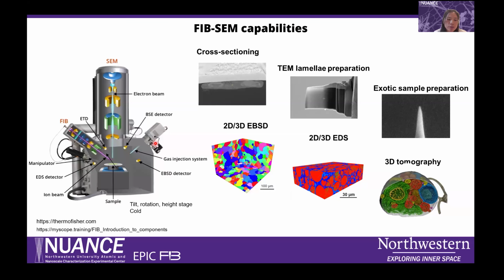This allows us to do site-specific sample preparation, such as cross sections, TEM lamella preparation, exotic samples like atom probe needles, and three-dimensional morphology. Besides that, there is the analytical work, the EDS and EBSD analysis.